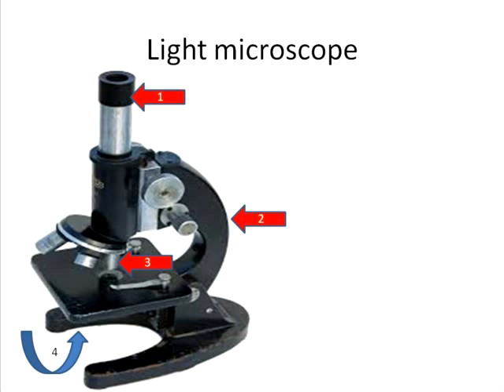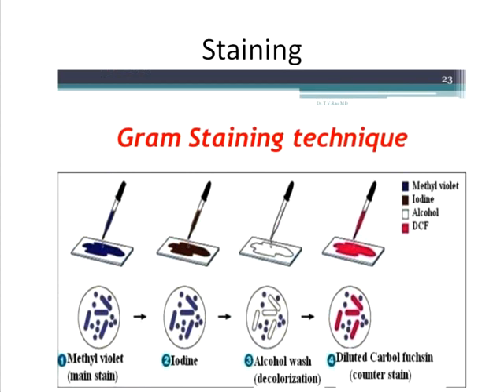To see bacteria, we need to stain them to make it easier to be seen through the microscope. There are many staining techniques to be made visible with a light microscope. To see objects which are microns in size, we use the most common and the simplest technique, that is the Gram staining technique devised by Hans Christian Gram. As you can see, there are essentially 4 steps. Step 1, 2, 3, 4.